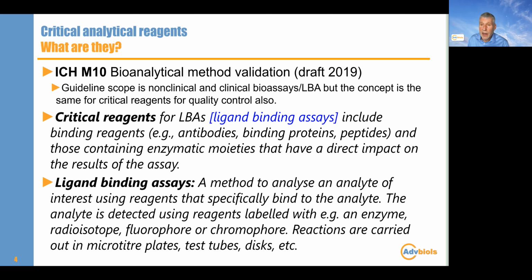So a typical IgG molecule does have a lot of variance, however you make it. A lot of that's down to the glycosylation, which is probably irrelevant, but there are other post-translational modifications. So it can affect them, and it can affect their binding, and that can affect the quality of the signal you get. And labeling is pretty important too. It'll depend exactly what you're doing with the antibody and the label.